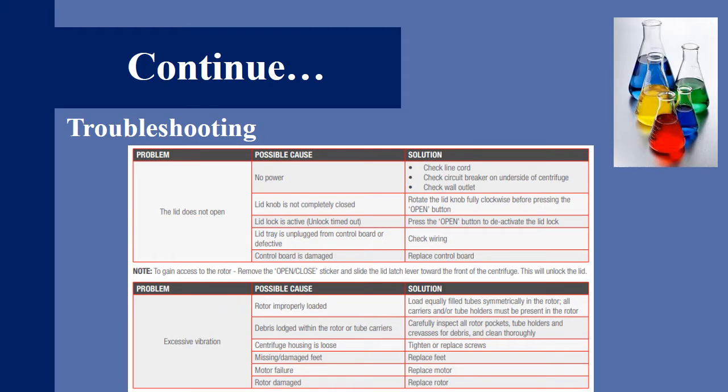Troubleshooting of the centrifuge. First problem is the lid does not open. The possible causes are: no power, lid knob is not completely closed, lid lock is active, lid tray is unplugged from the control board or defective, control board is damaged. If we have no power then we have to check the line cord, check the circuit breaker on the underside of the centrifuge, check the wall outlet. If the lid knob is not completely closed, rotate the lid knob fully clockwise before pressing the open button. If the lid lock is active, press the unlock timeout, press the open button to deactivate the lid lock.